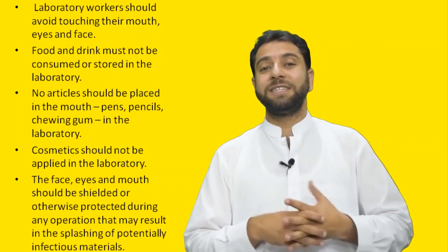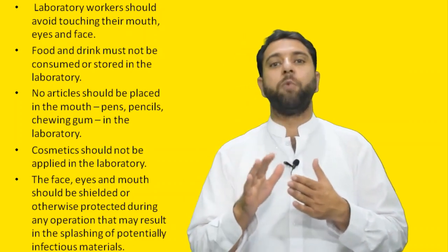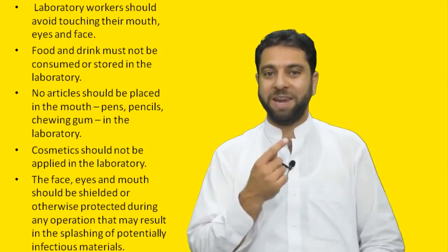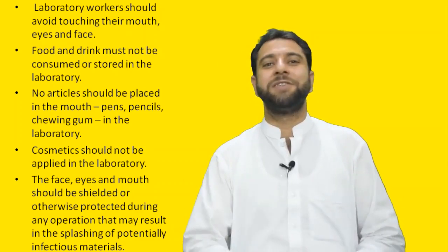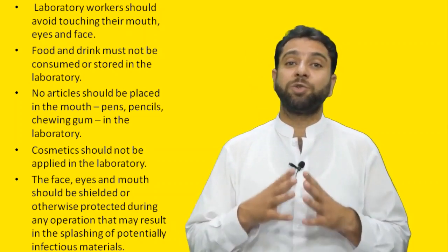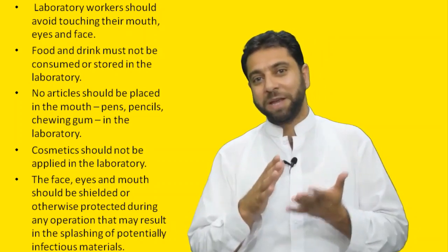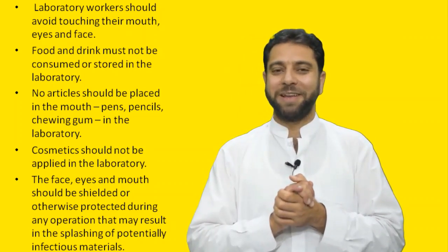Generally, it is our habit that when we are busy with some work or waiting for some results, we put a pen or pencil in the mouth. This is not allowed in the lab. So, no article should be placed in the mouth. Similarly, cosmetics should not be applied in the laboratory.